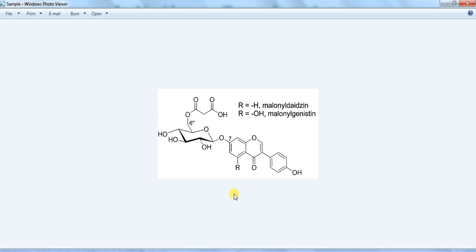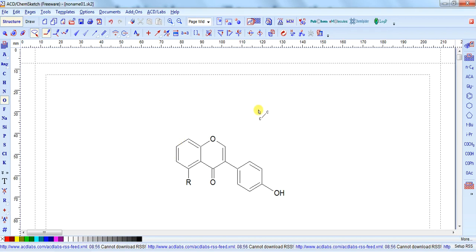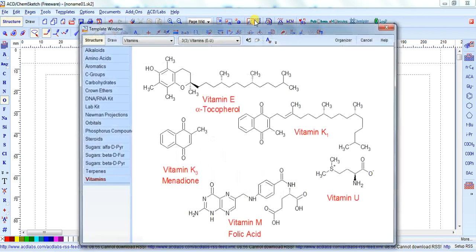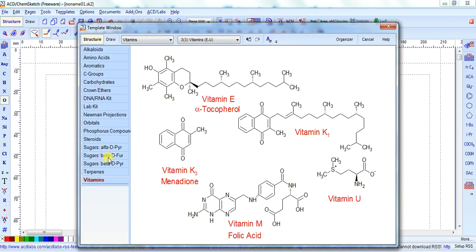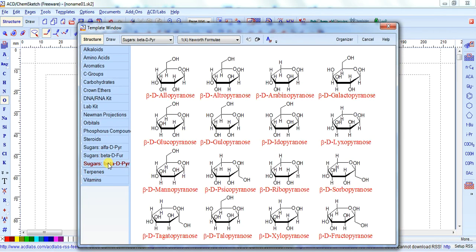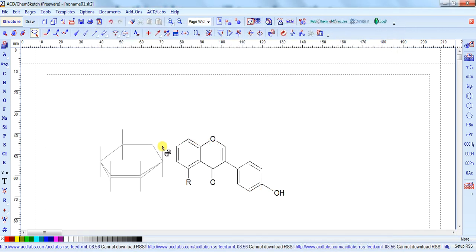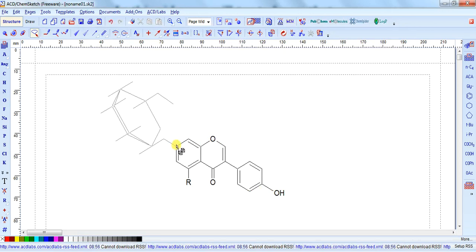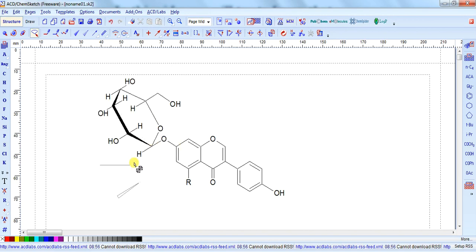Now we attach the other glucoside. So on this position, go to the window, and here you can find our beta-D glucopyranose. So we click on this and take the glucopyranose. Whichever position we want to attach it — click on that position. We want to attach this position, so click on it, and on which atom here it is — so this one. I want to attach here, so when you use it, click on it and it automatically connects.